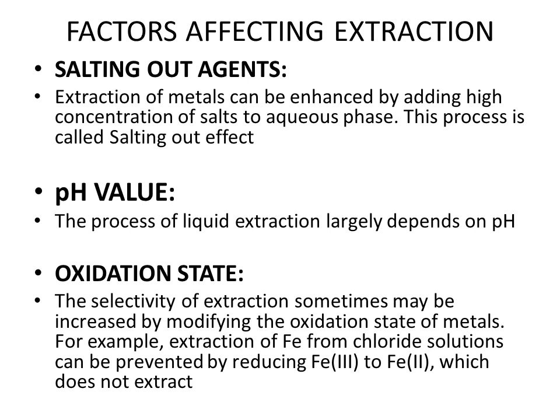Another factor is the pH value. The process of liquid extraction largely depends on pH. It depends on the solutes, so for different solutes, extraction efficiency varies with the change in pH value.